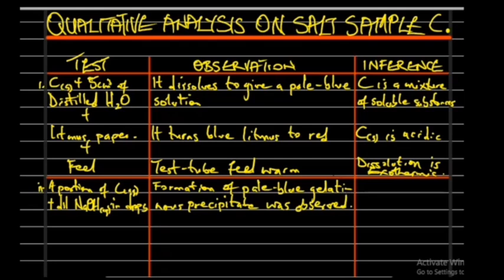Inferring from this, it seems that there is the presence of Cu2+. So Cu2+ is present.